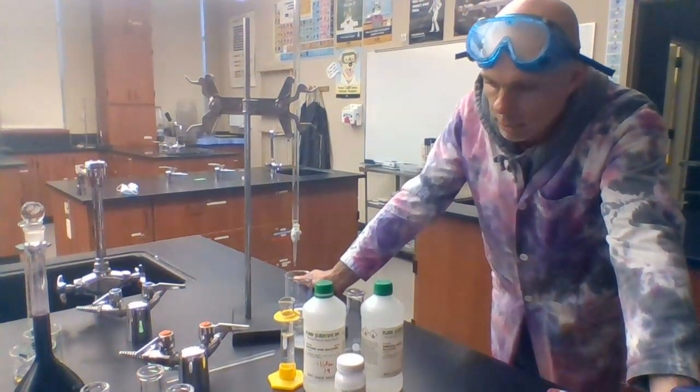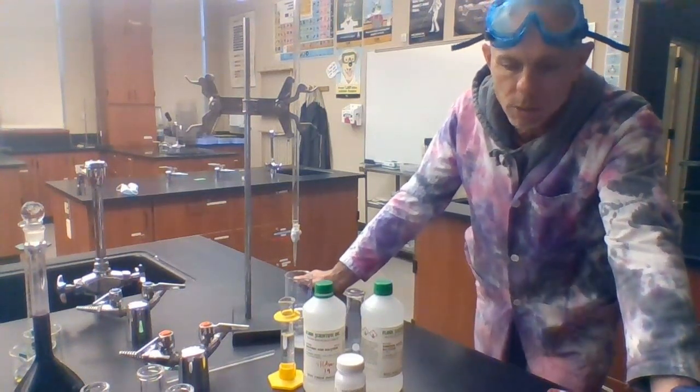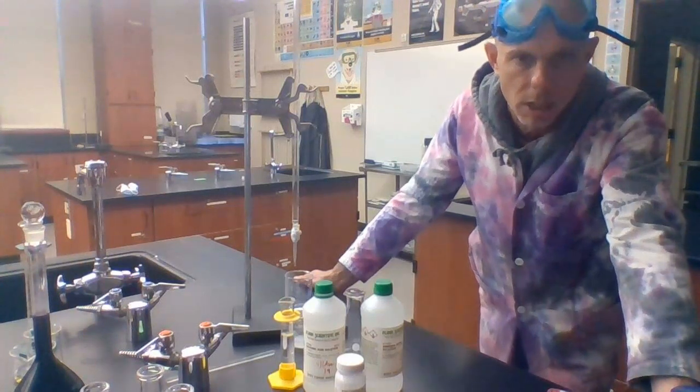Welcome, everybody. Mr. Johnson here with you. This is the first video of three on titrations. Titrations are a technique that is used in chemistry to determine the concentration of an unknown solution.